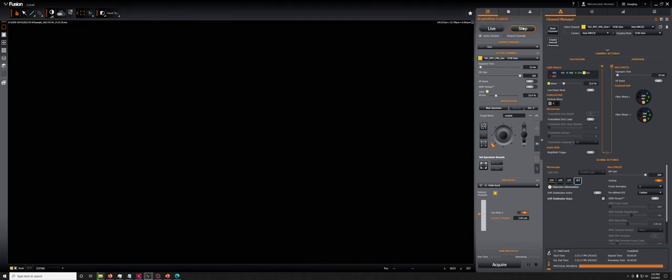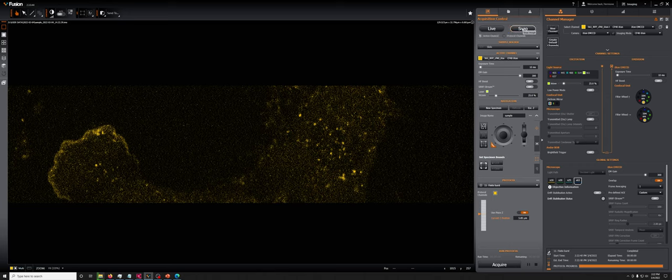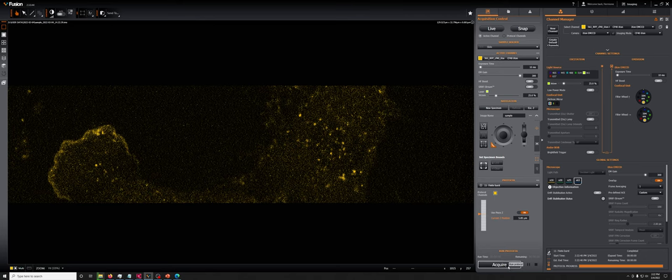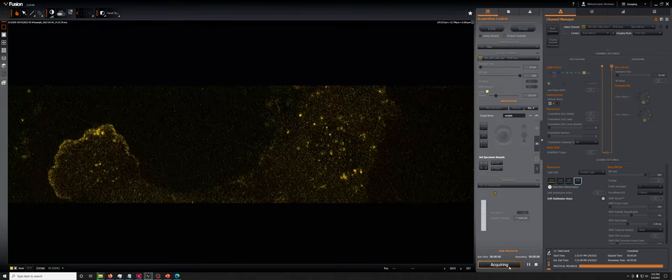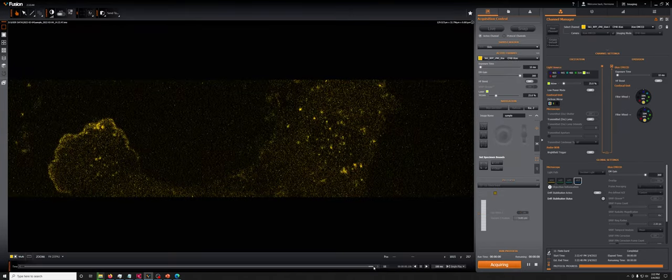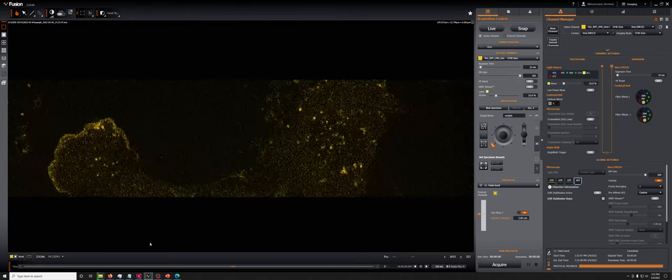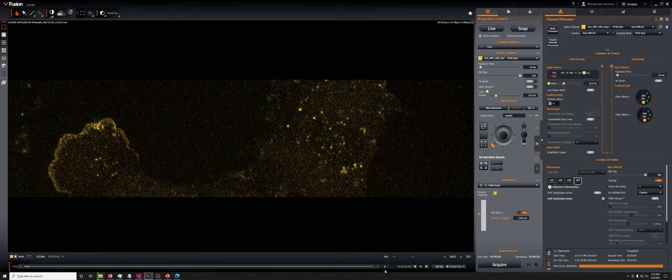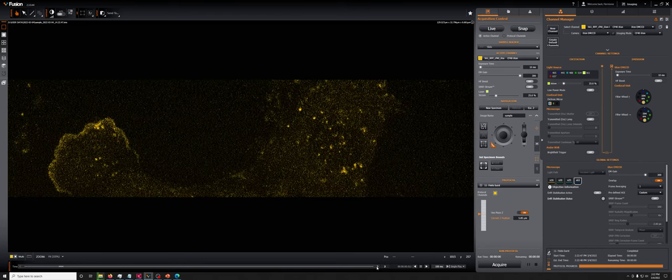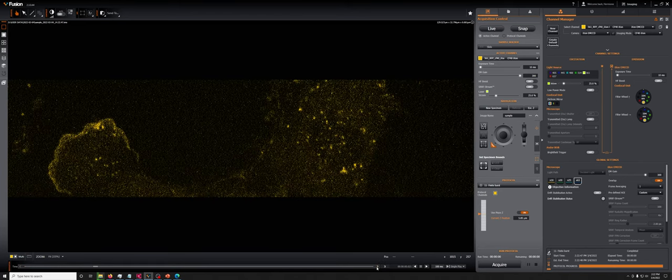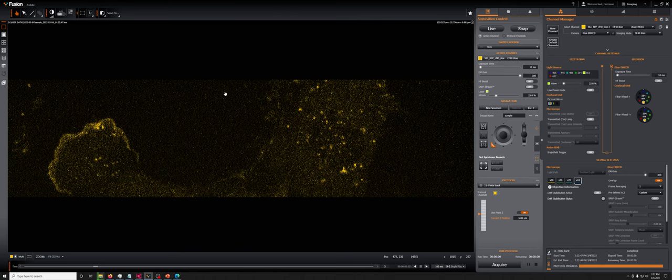If I snap an image, let me just make sure it's the right size. So this, we're getting quite a bit of information. And if I now hit Acquire, you can see that the speed is the same as if I had cropped at 256 by 256.